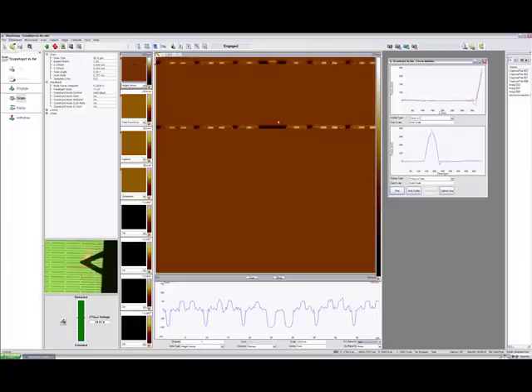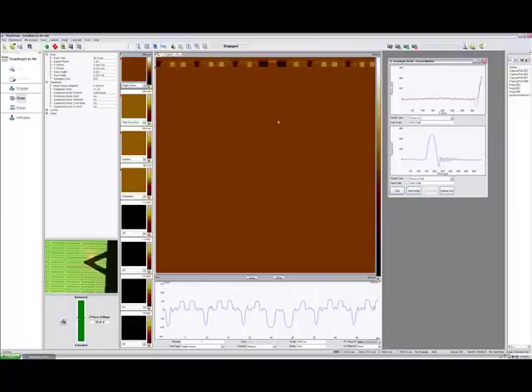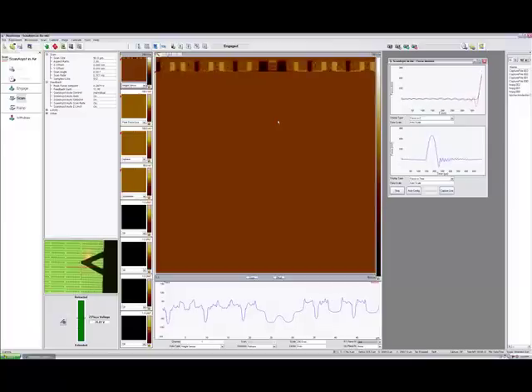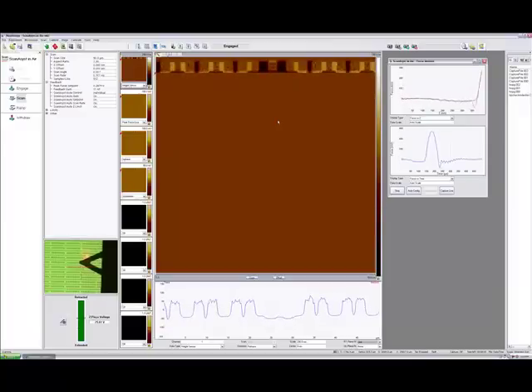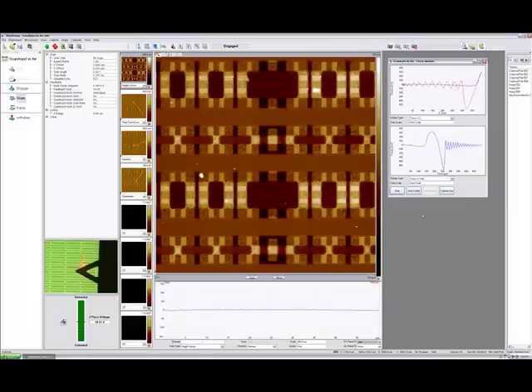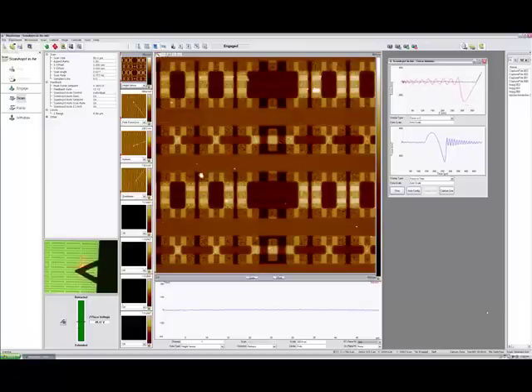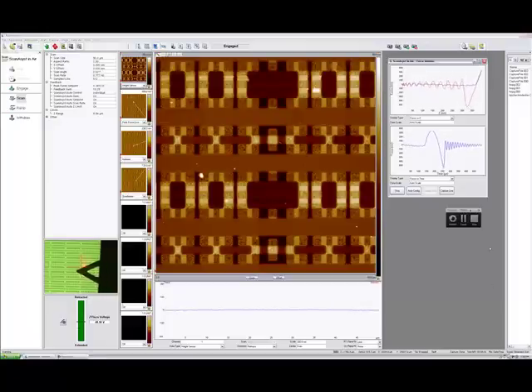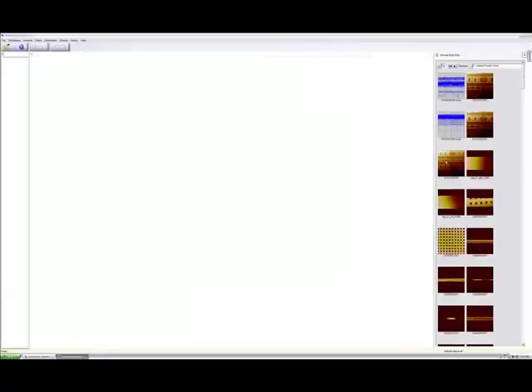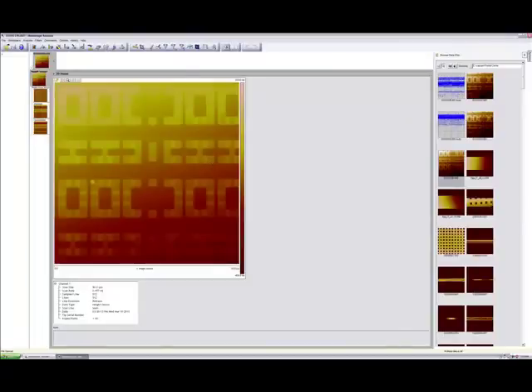We also started the scan to go top to bottom. You can see the actual line trace in the bottom window — it's clean, it's tracking fine, there are no streaks. Without changing any parameters, we continue through the imaging process and you can see the image almost being finished. Again, it's a very clean image. We save it after capturing, then go to the image analysis and drag the image into our analysis window. We simply plane-level it.